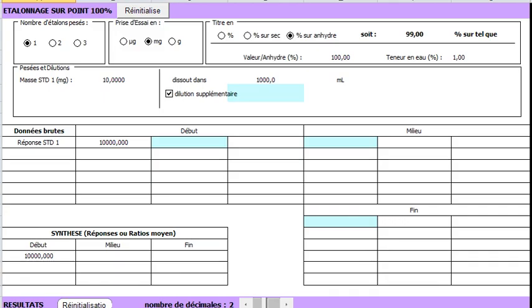Now we fill the form with the parameters concerning the calibration system, the standards. Here we select how many 100% points were done, because this is what we chose before. We selected 1.